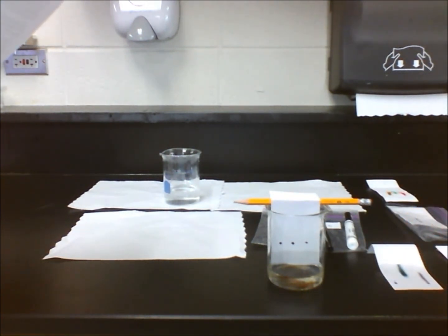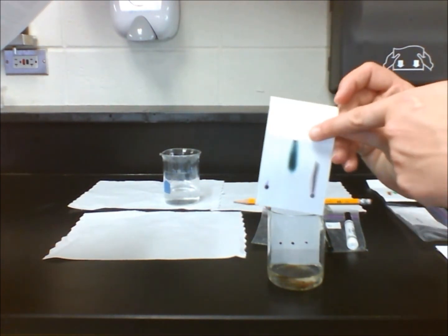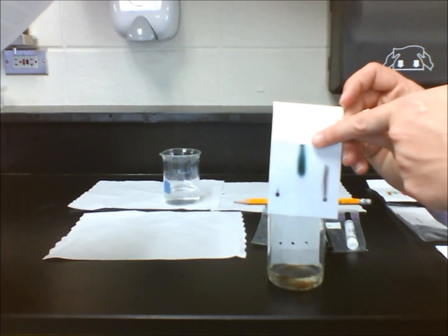The dyes travel up the paper because they are soluble in water. We can determine which dye is more soluble by analyzing the location on the paper. If the solute moves up the paper farther and faster than the other dyes, it's most soluble. If, on the other hand, it moves up slowly, the solute is least soluble.